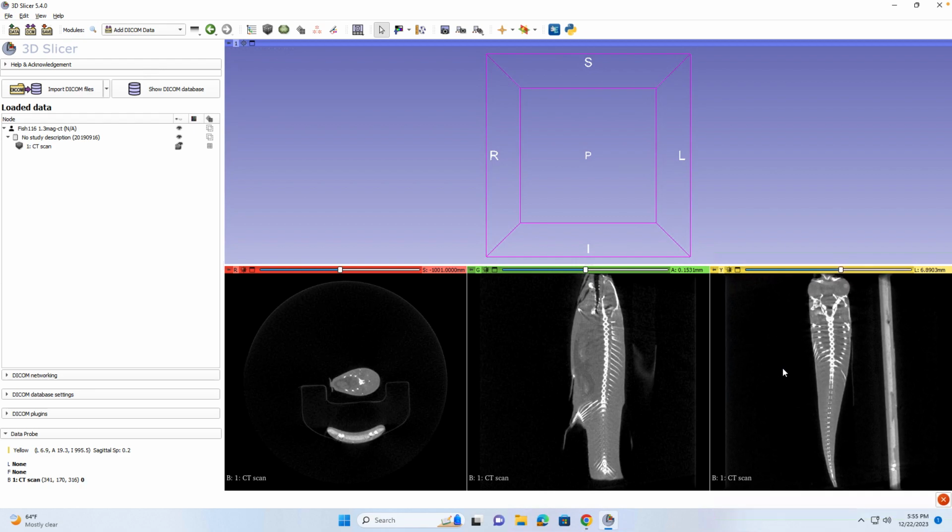So here you can kind of see the spine on this right hand corner. It'll do the same thing in the middle, and this one's going to be moving through the top of the fish. So this will be a good kind of indicator or view of where that spine is and how deep you're getting into the spine. As you can see, the spinal canal, I guess you could say, it has a little hole in between the white. That's where we're going to be looking at the entire time.